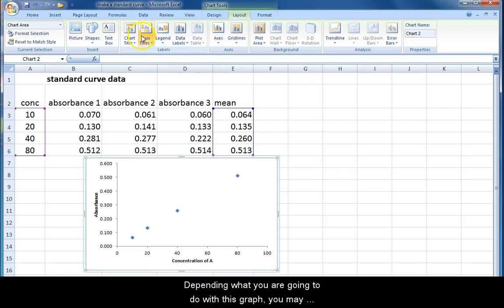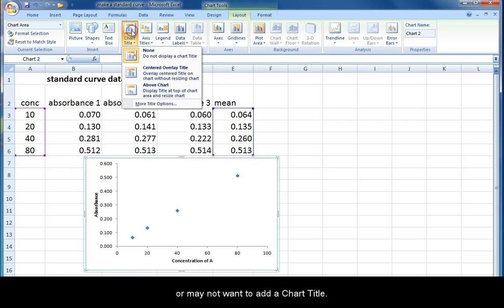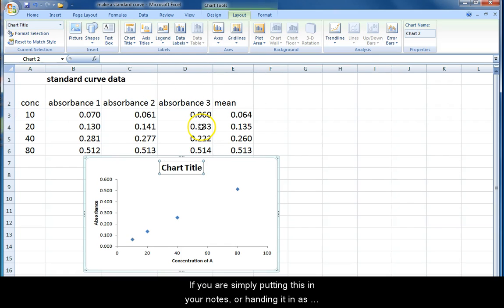Depending on what you are going to do with this graph, you may or may not want to add a chart title. If you are simply putting this in your notes or handing it in as part of an assignment where you don't need to write a figure legend, go ahead and give the chart a title, but make it a meaningful title that is not concentration A versus absorbance. I'm going to call it standard curve for A.